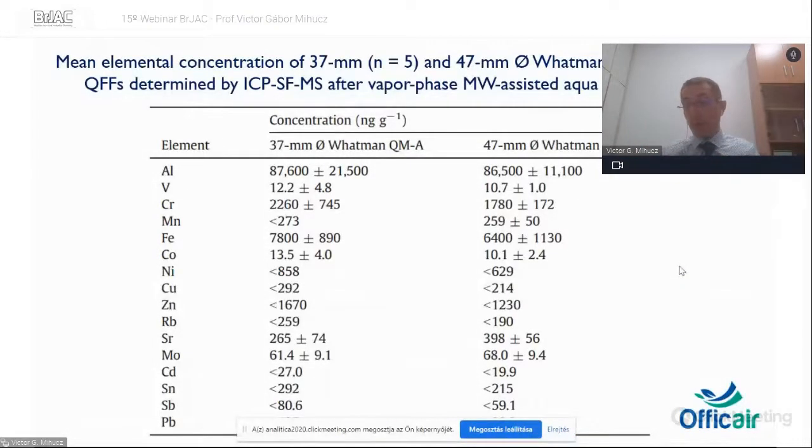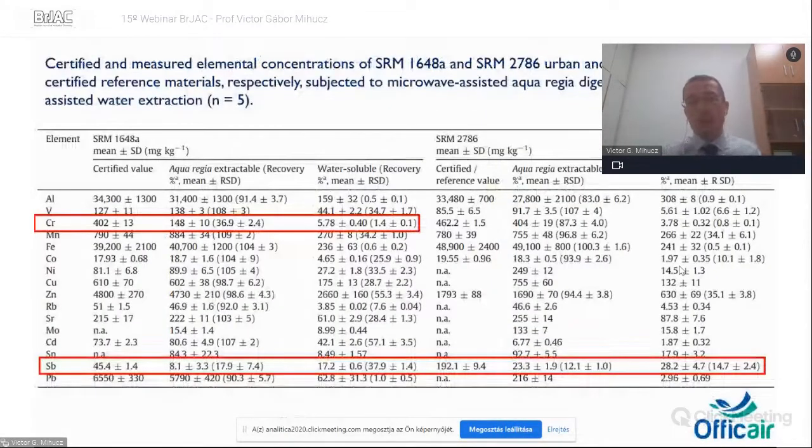And the biggest problem, because the oxidative potential measurement went very well with the quartz fiber filter sample, so we opted to do the sampling on quartz fiber filters. And then the problem we encountered is the huge blank values for aluminium, for iron, for chromium, and so on. Of course, the oxidative potential measurements also work with the Teflon, but for the full filter, not for cut discs. And we wanted to get as much information as possible.